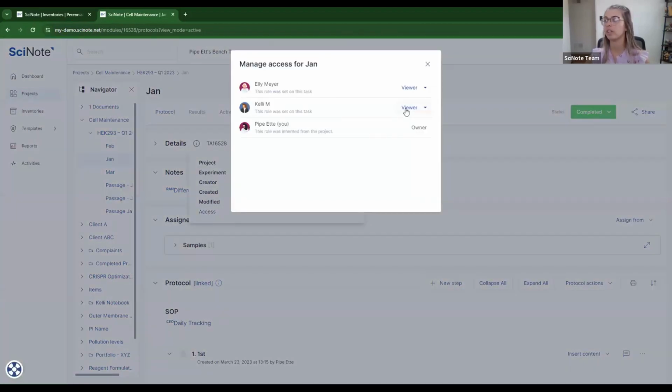And maybe now, even though I have Kelli M as a viewer of the experiment, maybe I want them just as a technician for the task. So that way they're not creating things, they're just completing things. The same thing can then go with your custom permissions downstream. So if you have a viewer signer, you might have them as a user up top, but only on the task, they might be viewer signer.